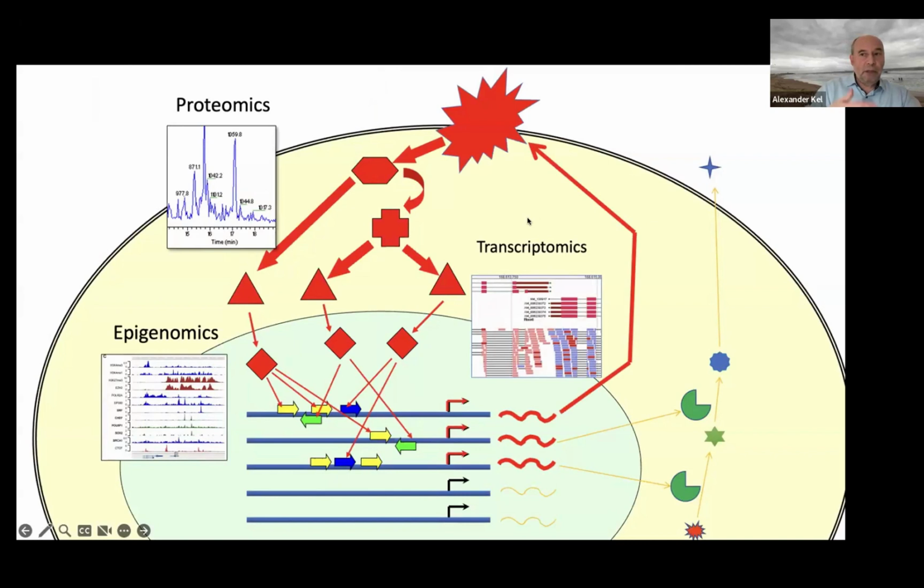All this is done with the help of various types of omics: expression with transcriptomics. The network can be facilitated when you have proteomics. And what we talk about today is epigenomics. ATAC-seq is one method of the whole area of experimental methods to study epigenomics. So what happens not in the genome, but above the genome, on the epi level.